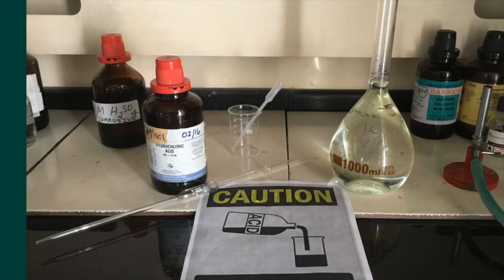This would not be adding water to strong acid, this would be adding water to very dilute acid. And the bulk of the water would have been put in first, and then the acid would be added, with only the remaining bit from the neck up being added to ensure that you do not exceed the mark and you do not affect the accuracy of your dilution.